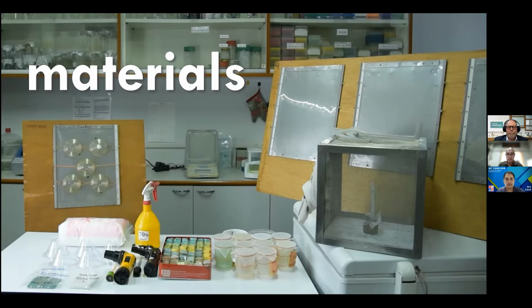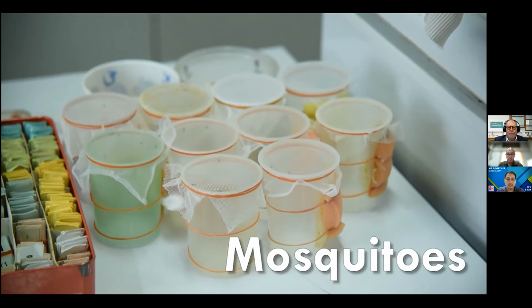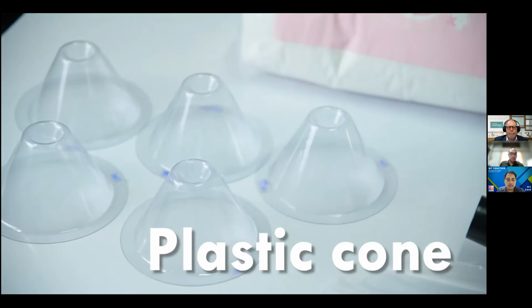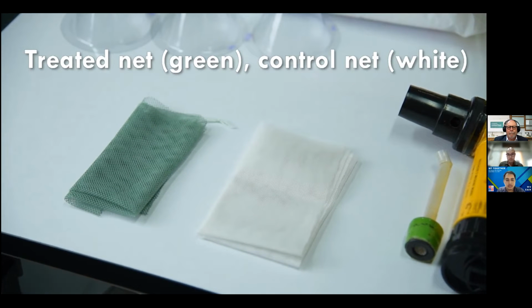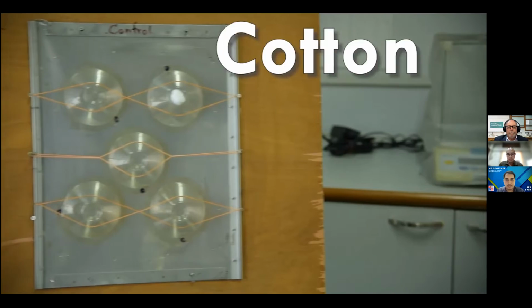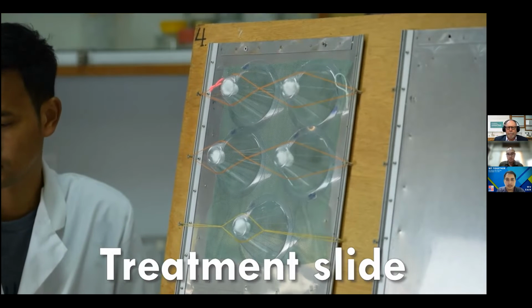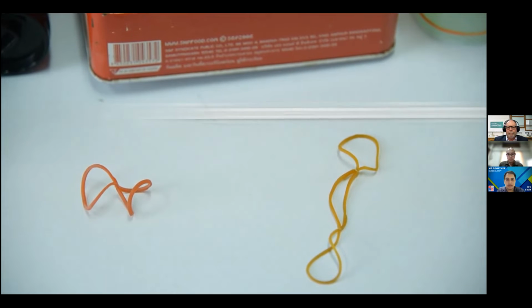The following are the main materials or items you will need for the assay: labels, mosquitoes, mechanical aspirator, plastic cones, treated net, green, control net, white, 70% ethanol, cotton wool, control slide, treatment slide, 2-ring rubber bands and 3-ring rubber bands.